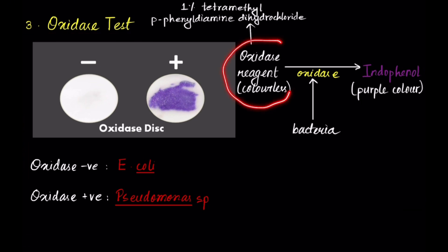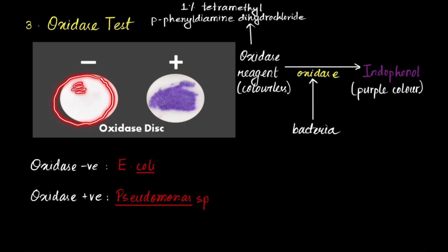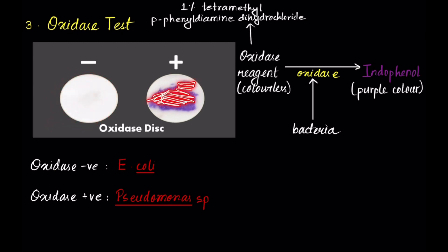Next is the oxidase test. Here an oxidase reagent is used, which is colorless — you can see here we have an oxidase disc which is colorless. Bacteria is inoculated into this reagent. If the bacteria produces oxidase enzyme, the oxidase reagent produces indophenol, which is observed as a blue/purple color. Oxidase negative shows no formation of purple color, while oxidase positive shows purple coloration due to the production of indophenol.